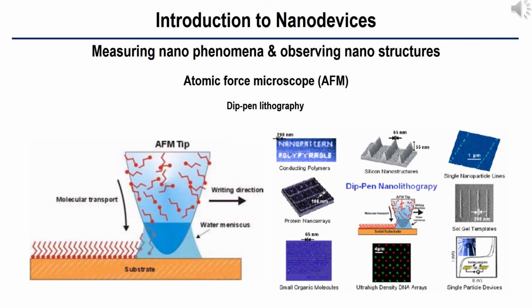Similar to AFM-based lithography, there exists another tip-based patterning technique. This technique was developed by American chemist Professor Chad Mirkin at Northwestern University in Chicago in around the late 1990s. This technique uses an AFM tip covered by chemical molecules. These molecules are transferred from the tip to the surface of a designated substrate. By moving the tip with nanometer position control, it is possible to write a variety of materials including proteins, DNAs, nanoparticles, nanowires, or quantum dots on the substrate as shown in the right figure.